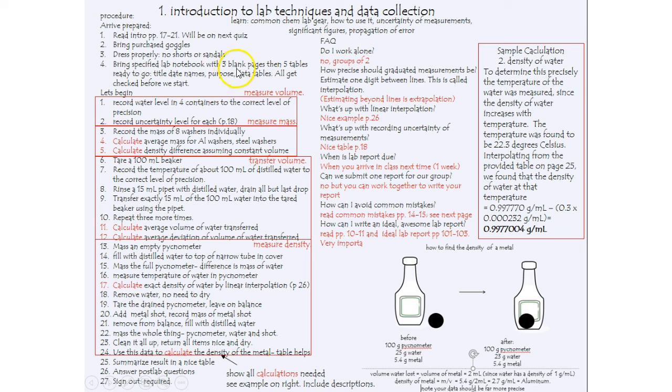Make sure you've left the first 3 pages blank and you've included the 5 tables required for this experiment. I'd like to see the title, the date, the names, the purpose, and those 5 data tables. These need to be checked out before you can start, and it's to ensure that you're going to be working safely and show that you are coming prepared. To begin with, you'll hear this basic lecture, and hearing this first as a screencast should help.